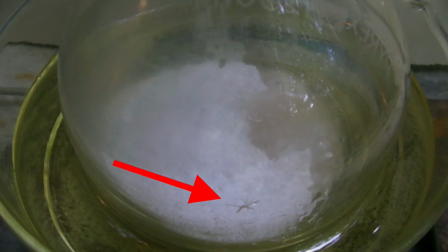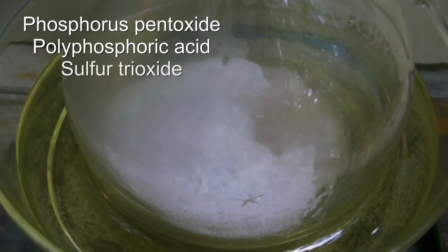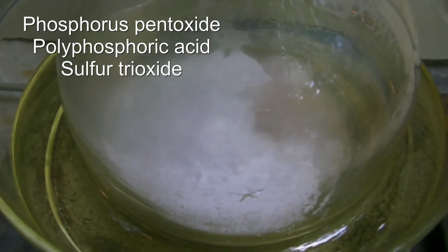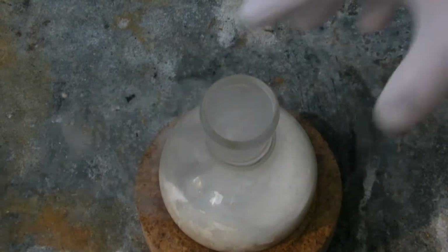Another problem was that there was now a mixture of phosphorus pentoxide, polyphosphoric acid and sulfur trioxide in the flask. All of the compounds react very exothermically with water. Sulfur trioxide can even explode on contact with water and is a strong oxidizer. Sulfur trioxide forms a dense fog in air.